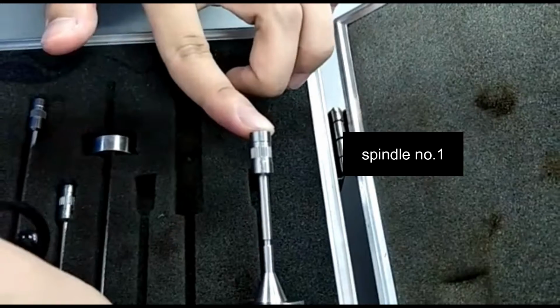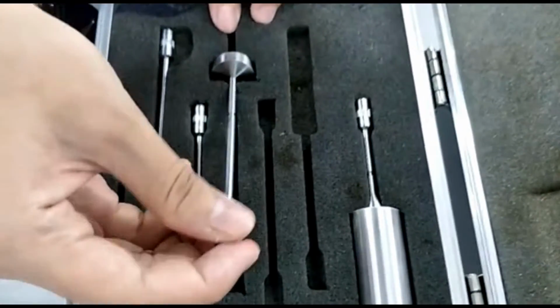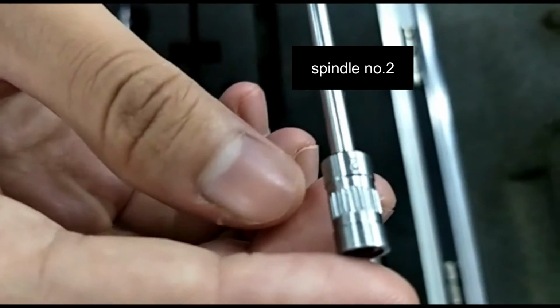First is spindle number 1. It's the biggest out of the 4. The spindle number 2, then spindle number 3, and lastly spindle number 4.